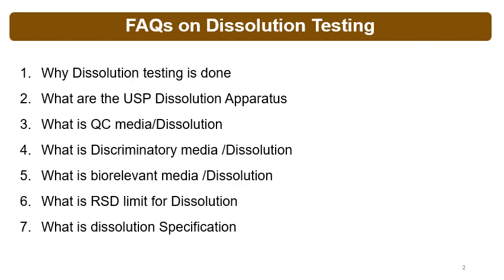So QC media and discriminatory media is always asked. See, QC media should be discriminatory media, and nowadays regulatory authorities are asking that the QC media should be discriminatory media.